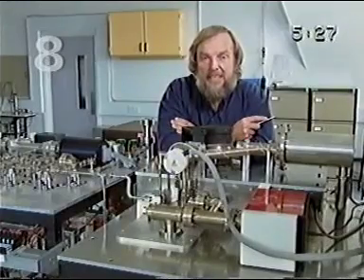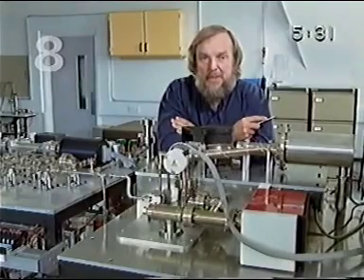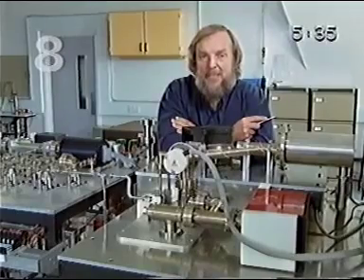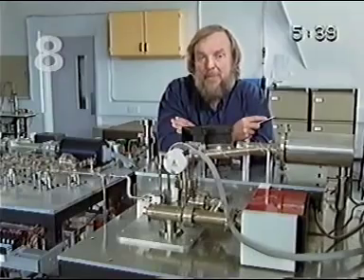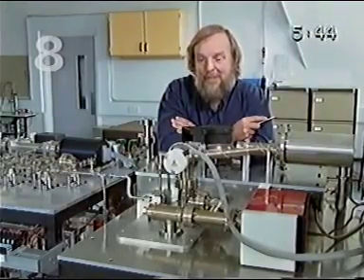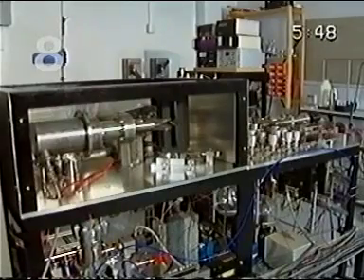As I have already indicated, the minor isotopes of an element make up only a very small proportion. We have to be able to measure this abundance relative to the main isotope very precisely. The problem is that mass spectrometers are very different the world over. This mass spectrometer here is quite different from that one on the opposite side of the room.